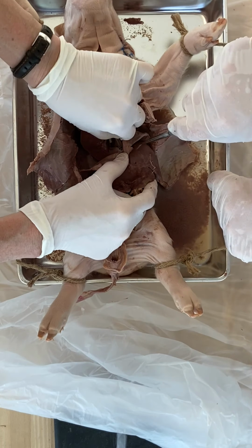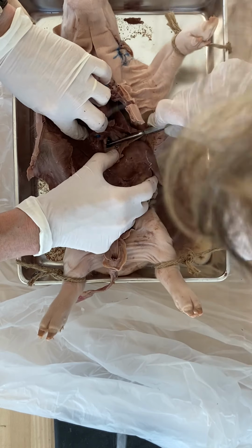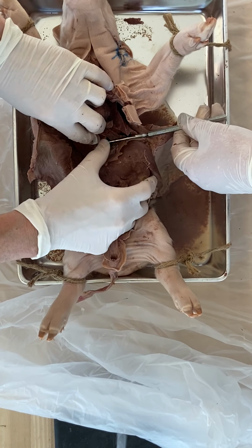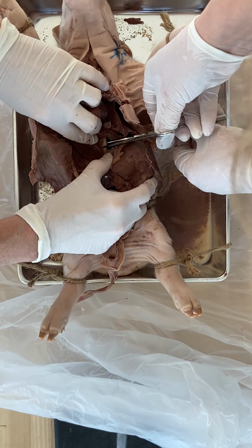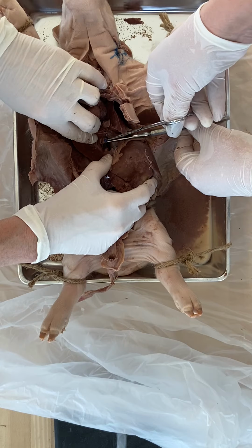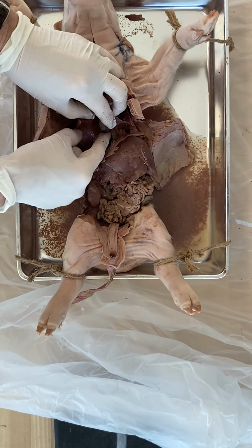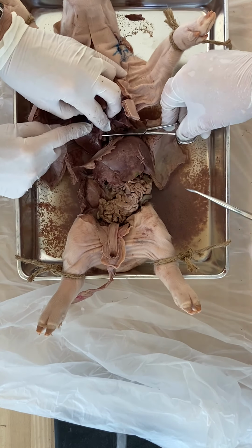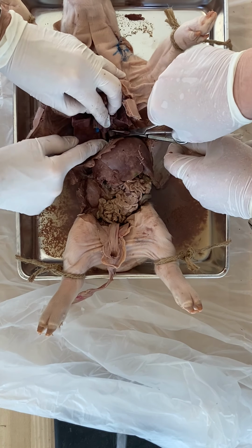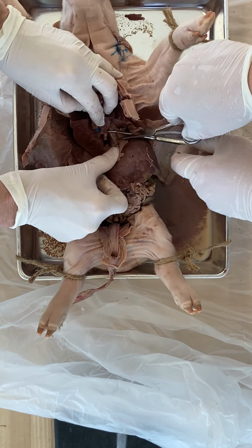Well, hang on. What's this one? Look, we've got this one. There's also the vena cava. One's going to be vena cava. The inferior vena cava. That's a blood vessel. So the middle one, this one here, is the esophagus. One of these is the vena cava, and the other one is the descending aorta.